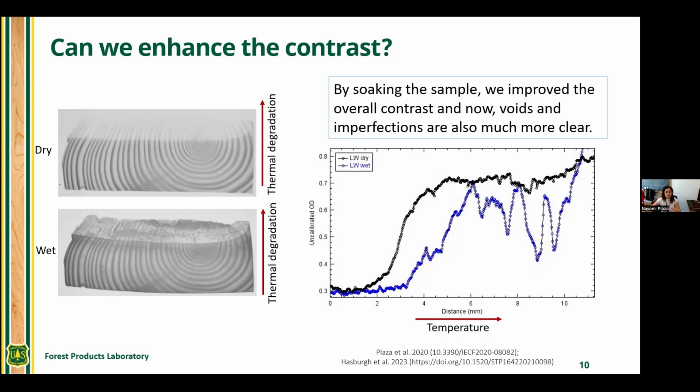So for a lot of the subsequent experiments, we really focused on the dry specimens instead, so that the effects of cracks were not as problematic in the quantitative studies. But this is an ongoing area, and we're trying to start looking at how thin we can measure the samples. It's an easy experiment to do, and the facility is fairly close by.